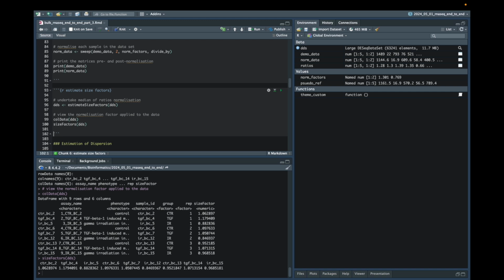It has one major advantage in that it allows us to extract the normalized counts data. And I cover this in a little more detail in the accompanying blog post, so I'm not going to cover this here. But essentially, once you've estimated the size factors explicitly in the way that we've just seen, you can then use the counts function that we saw in the last tutorial to extract that normalized counts matrix by adding the additional argument that enables that.